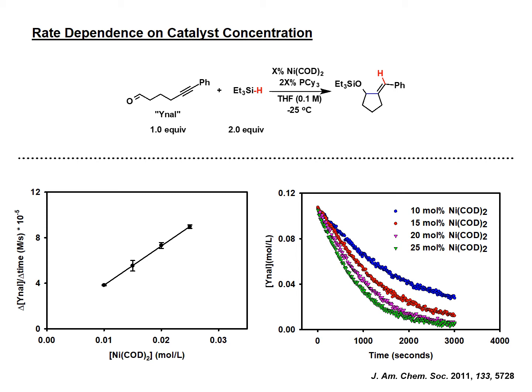And just to show there's nothing funny going on with this chemistry, you can look at the entire rate progression, the entire reaction progression, and see that these reactions all behave similarly. There's none of them that sort of shut down early or one that does something sort of wonky here in the middle. They have these nice, what appear to be first order or at least positive order decays. So we have a positive order on a nickel catalyst.